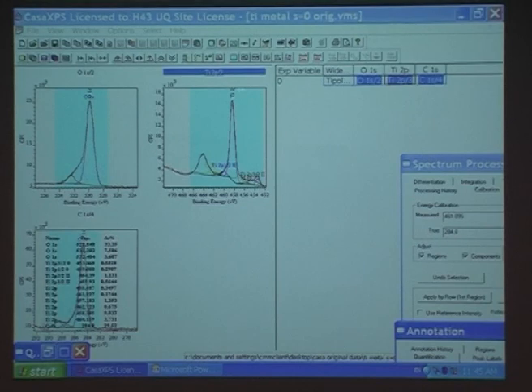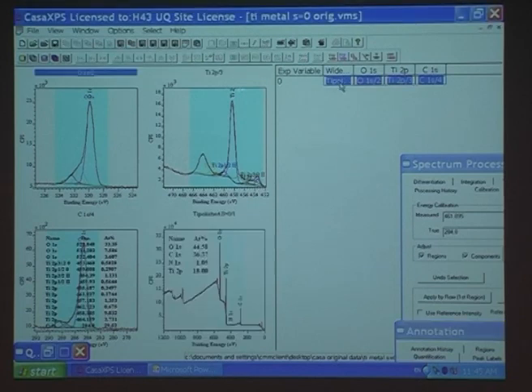Again, that's a full summary. I need to look, and oxygen's coming mainly from this one. There's all these other intermediate oxidation states. The carbon's got a bit of oxygen. I can put then the thing on here. Got lots of carbons, and there's a bit of carbon oxygen things as well. So that's again a summary.